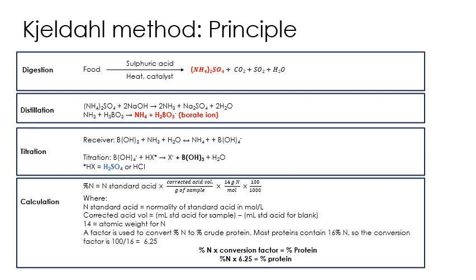So during the digestion, the nitrogen is free to form this ammonium ion. The sulfuric acid then further oxidizes organic matter, and combined with the ammonia form, the carbon and hydrogen elements are then converted into carbon dioxide and water.